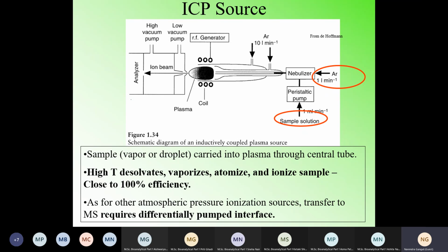So now, which mass analyzer are we going to study separately? We started with the basic fundamentals of mass spectrometry. We discussed why high vacuum is required in the mass spectrometer, and the pumps typically used for generating it.